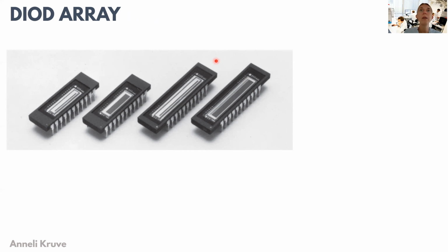The light passing through the sample can be divided in space by a monochromator, for example a prism, so that the lowest wavelengths that we are interested in hit this part of the diode array, and increasingly higher wavelengths hit further parts, and the end of the diode array is hit by the highest wavelengths that we are interested in.